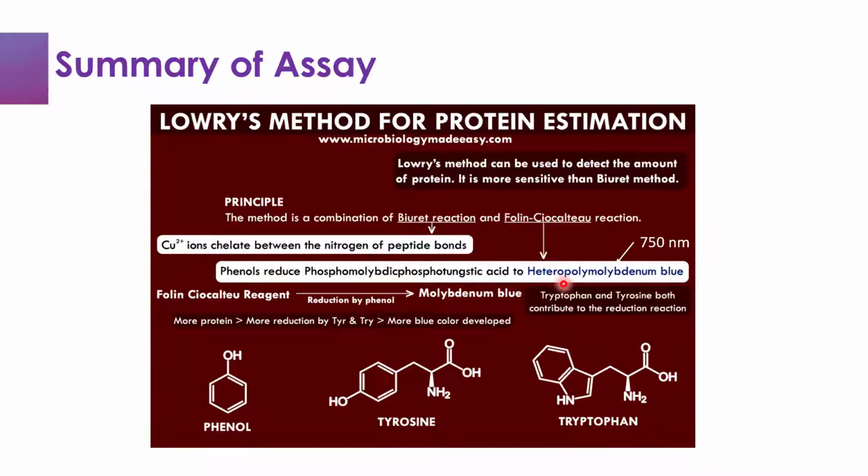And this has a maximum absorption at 750 nanometers.